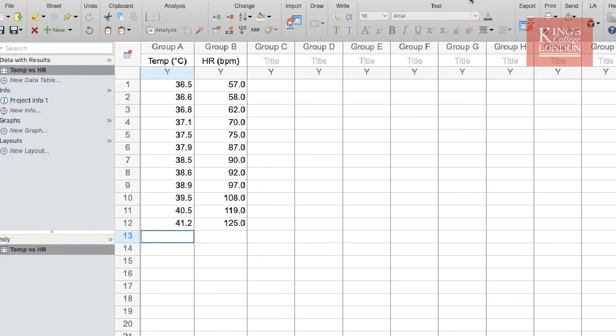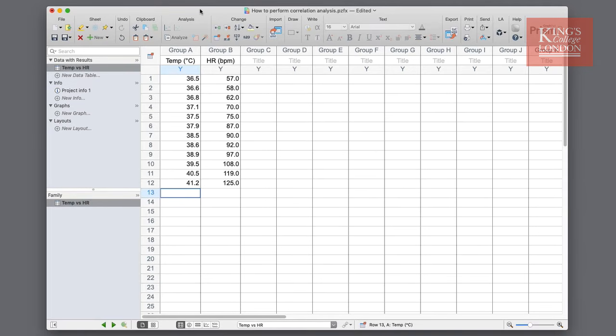Is there a correlation? By correlation, one does not mean can I plot a straight line through the data. That's a linear regression. What we mean by correlation is there a relationship between one and the other? Is there an association between the two data sets? GraphPad Prism can perform correlation analyses from XY, column and multiple variable data tables. In this example, I've entered my data in a standard column format.